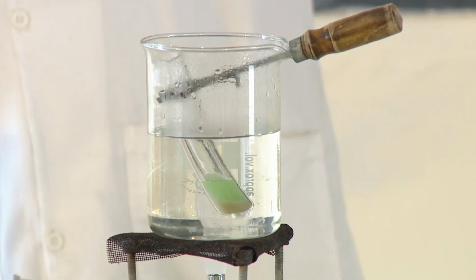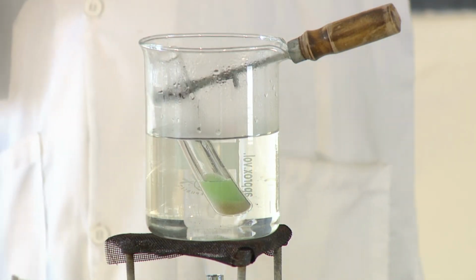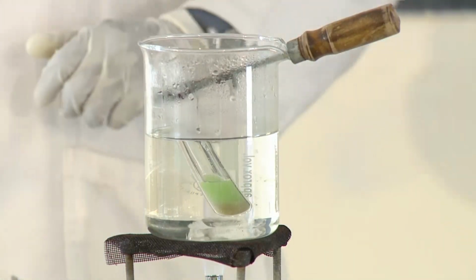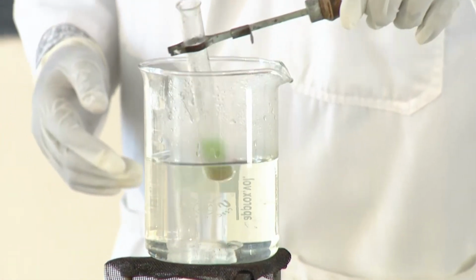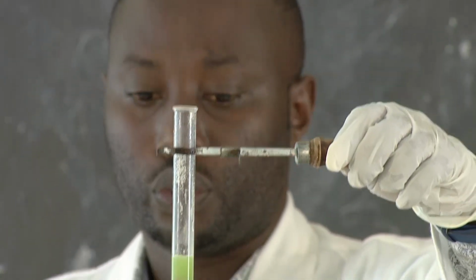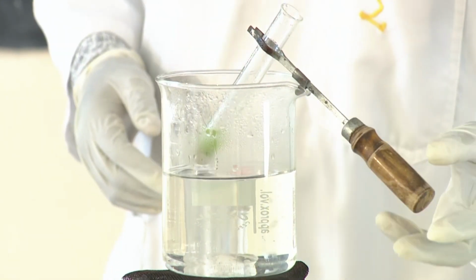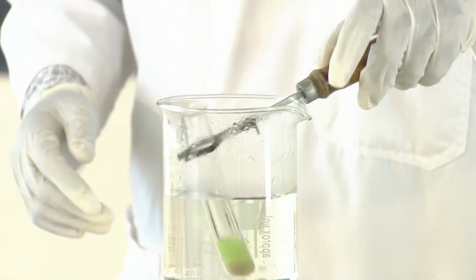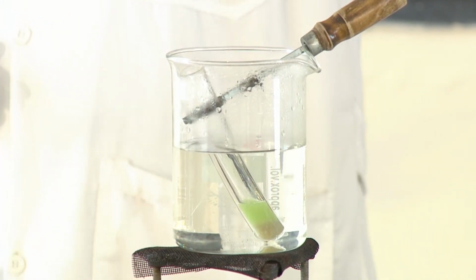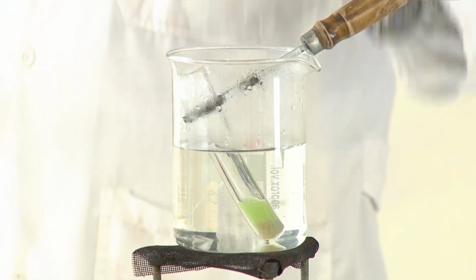You can have orange precipitate, or moderate orange precipitate, or you can also have what you call brick red. So let me just try, as you are seeing, it is changing to green. We are observing it is changing from blue to green. So let us note something on the chalkboard, and then we write it. Meanwhile, we need to wait and see if it changes from green to yellow and finally to orange or moderate orange.